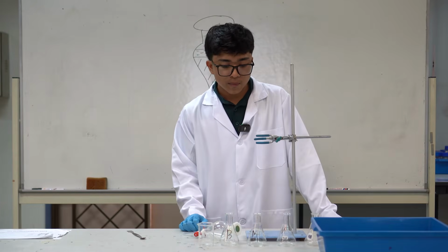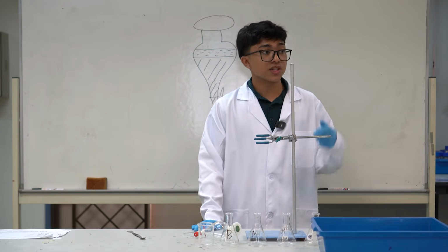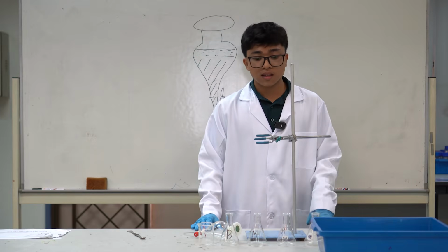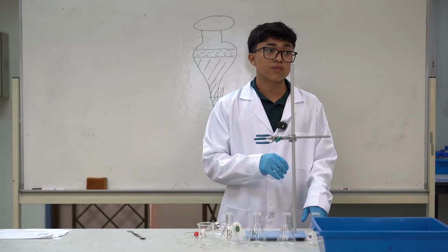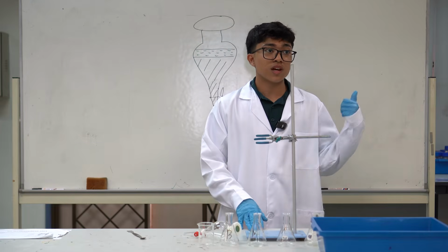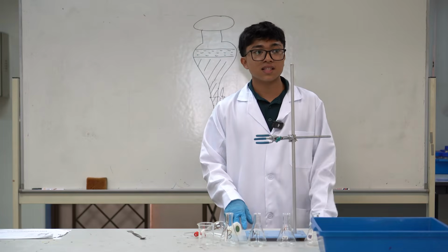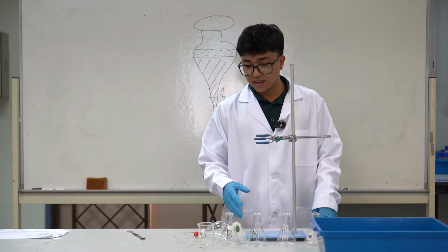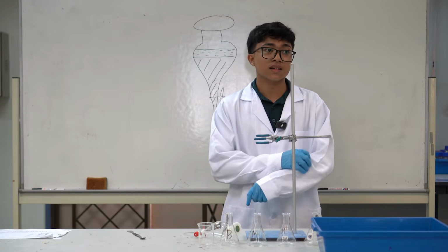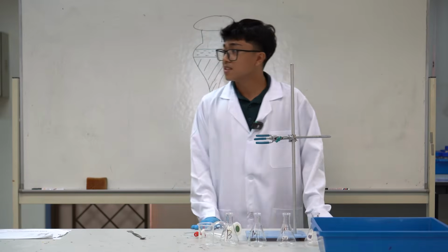Lastly, in case of emergency, there is an eye wash and shower inside the lab. If you accidentally inhale the fumes from the dichloromethane, make sure to go somewhere with fresh air and inhale the fresh air, and tell the person in charge. And also, when a chemical accidentally spills on you, you should wash it as quickly as possible. Okay, I think that's all from me. Hafiz?